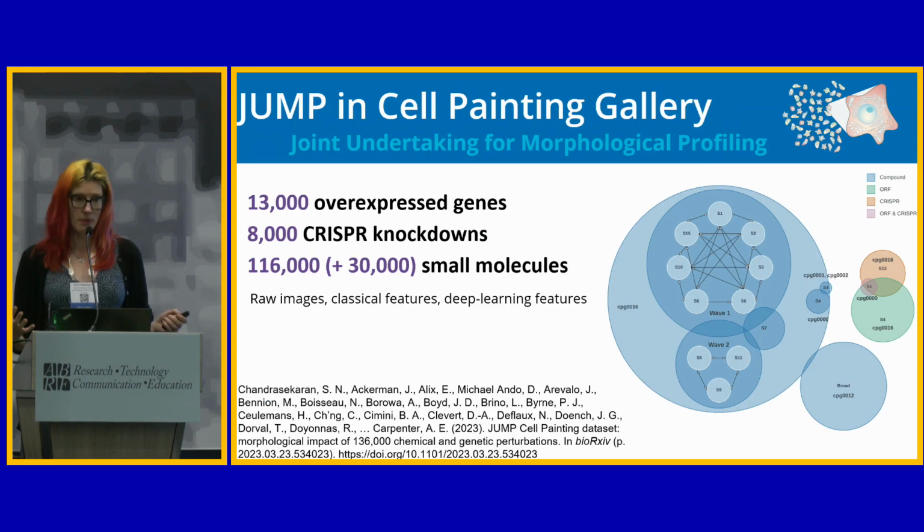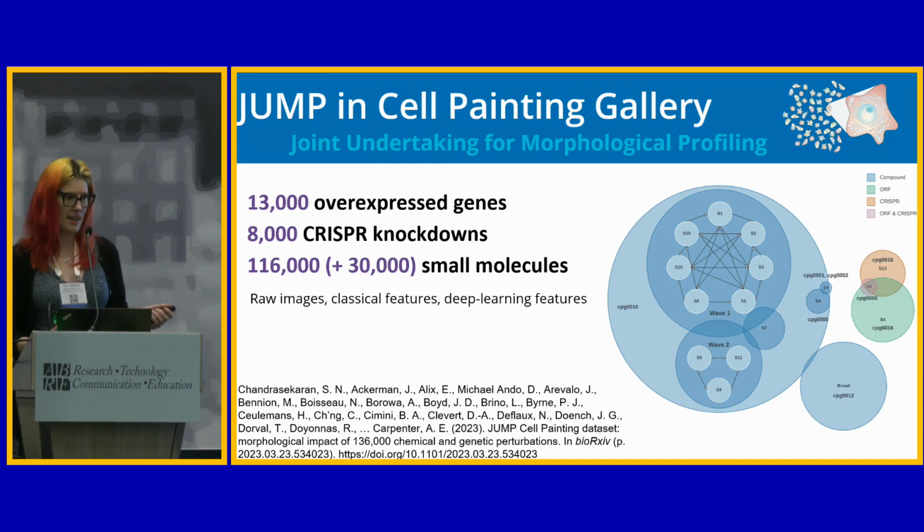And one example of that data set, if you've heard of cell painting, then perhaps you've heard of JUMP, where we had a project across many, many sites, many companies participated in this, to make a massive data set of over 100,000 small molecules, all profiled using cell painting, and it's all public and available for anyone to mine.